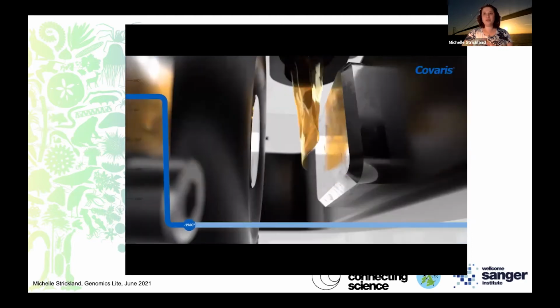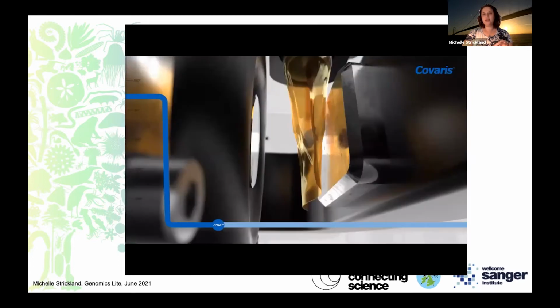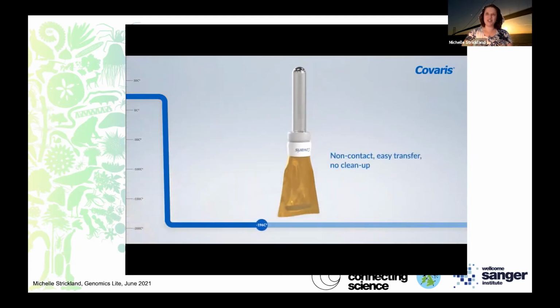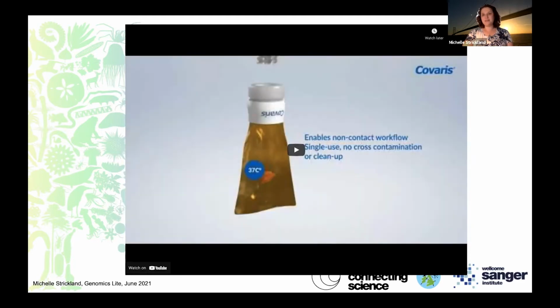The sample is then dropped into the machine in front of a solid plate, and that silver bolt is what is going to powder the sample. It is just a very controlled hammering situation. It's very satisfying. Then we just collect the powdered sample at the end of it, and that is what goes into our DNA lysis. So it's very quick and very clean. The nice thing about it is one sample goes into a closed system, so there's no chance that we can mix anything up or get two samples in the same tube.